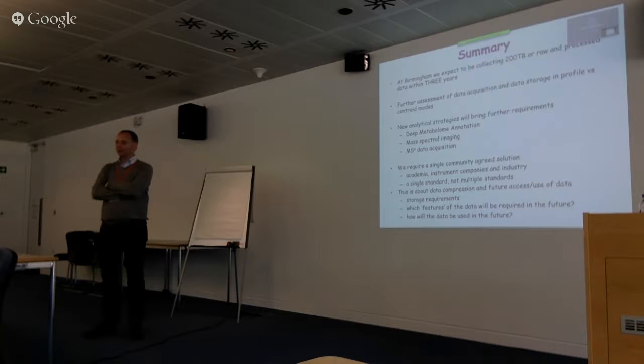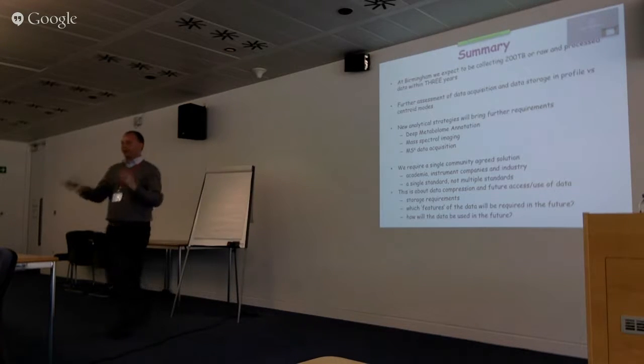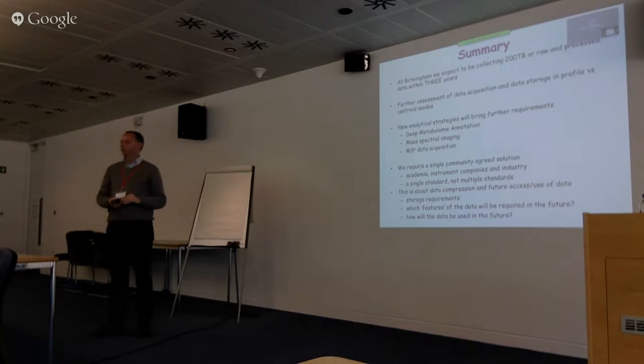That's why you get the question of what is the standard or how to deal with it. A big solution will be etc. But now leading to the question I had from your slide, a single standard, not multiple standards. In the context of what does it mean? Well, think about mzML and mzXML, how they came in. So is that just a data format? Yeah, it could be anything. I thought there's a sort of flavor of instruments that a single solution may not work for. So if you call that a standard, then it's multiple standards. Yes, I agree with that.